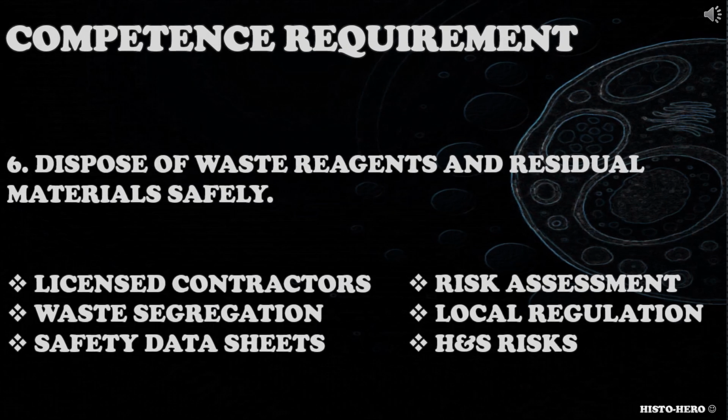The sixth competence requirement is for you to dispose of waste reagents and residual material safely. How do you dispose safely of reagents and residual material? What disposal risks are associated with those reagents and samples?